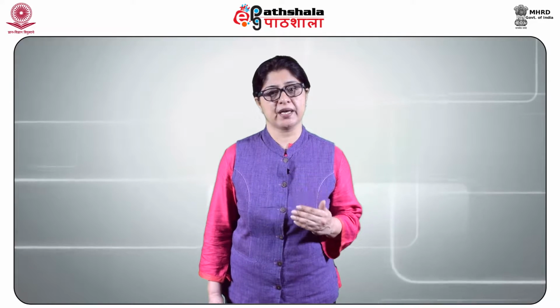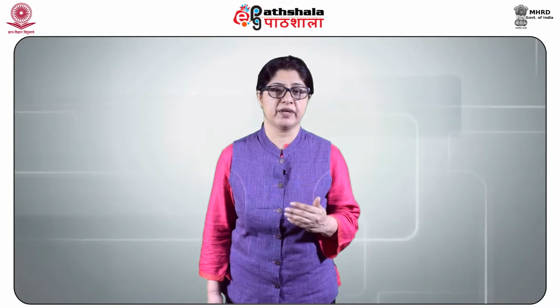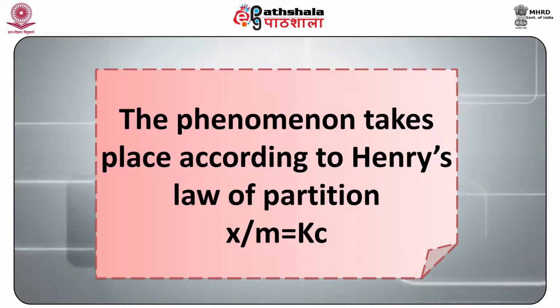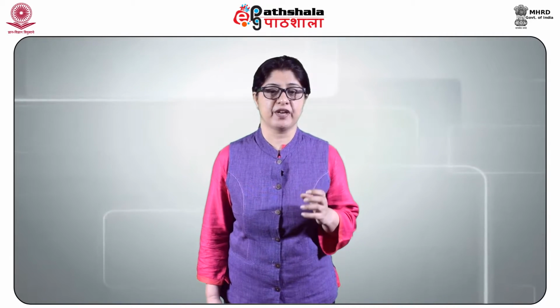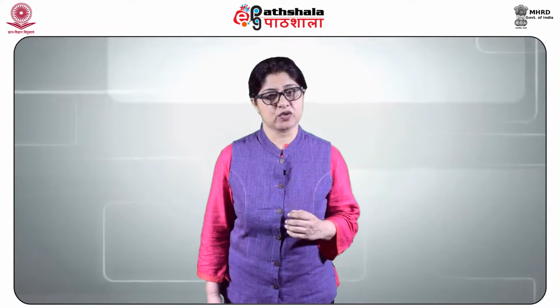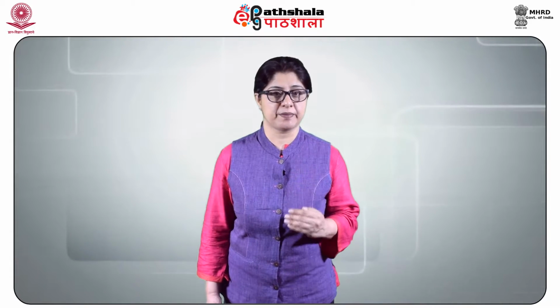Similarly, if the vapor or gas comes in contact with a liquid, a fixed quantity of the gas is dissolved in the liquid. The phenomenon takes place according to Henry's law of partition, that is x/m = kc. Now both phenomena are selective and there are different k values for different vapor sorbent pairs. The principles of gas chromatography can be explained in terms of the following experiments.